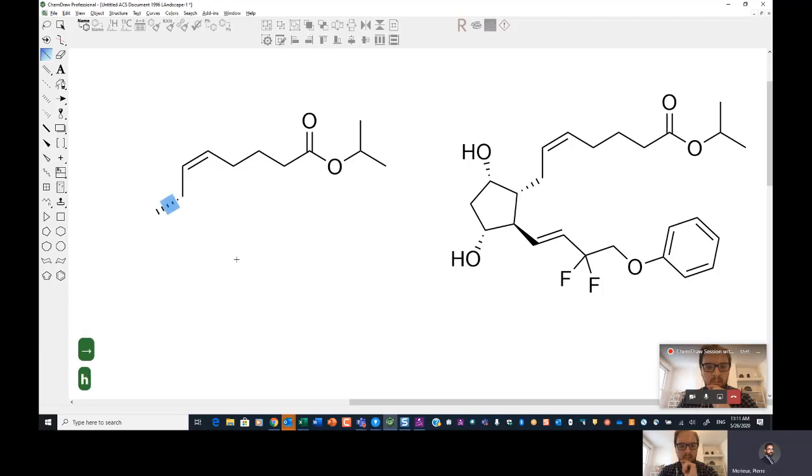And as you know, the H is, when you are over a bond, you press H to make it hash wedged. Okay. And then seven is the hotkey for the cyclopentyl. So seven on an atom will sprout the cyclopentyl. So from there, we can do that.